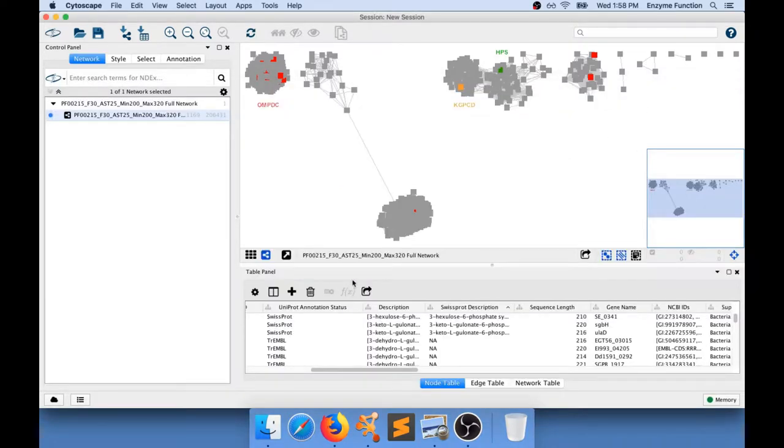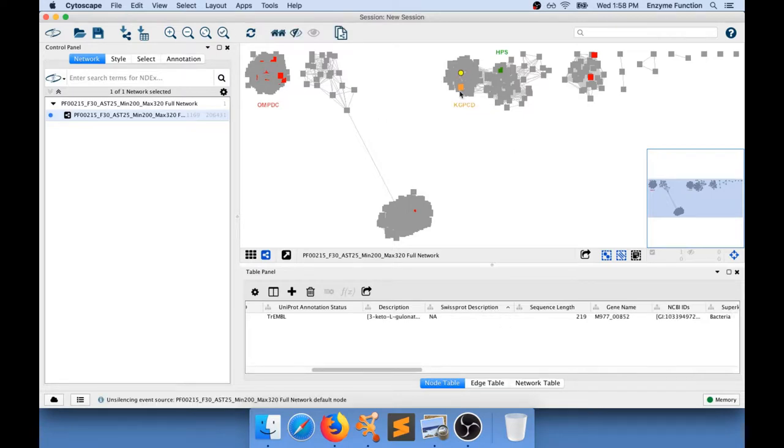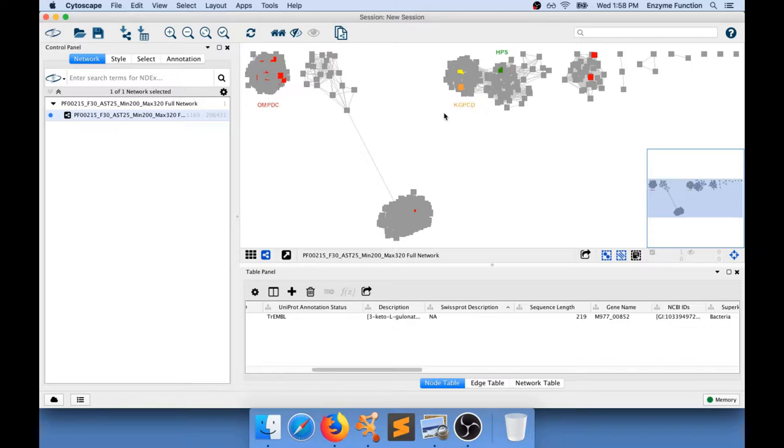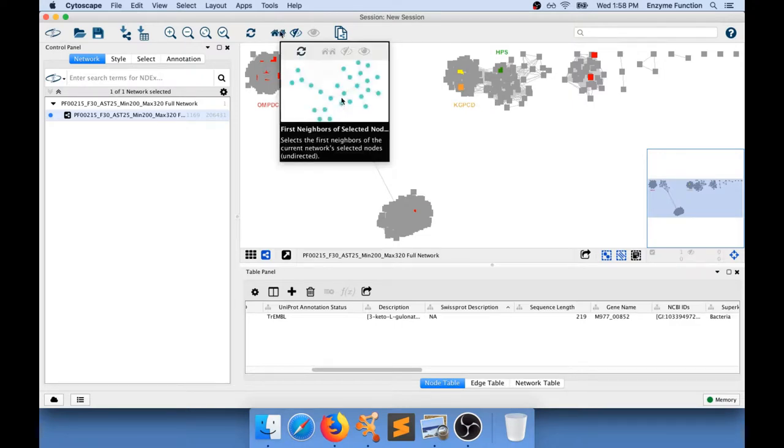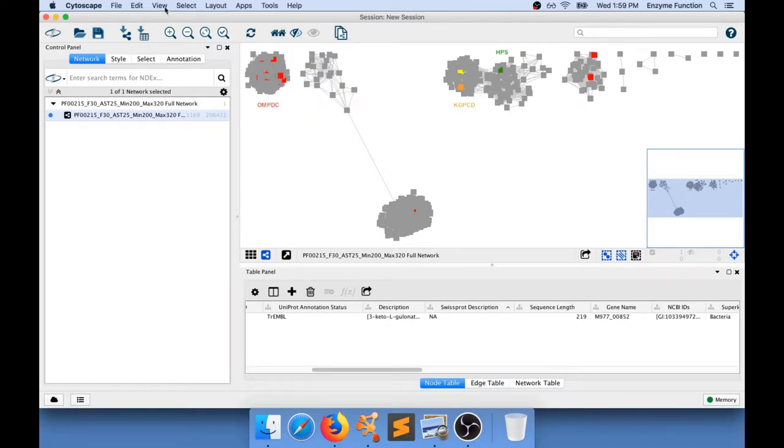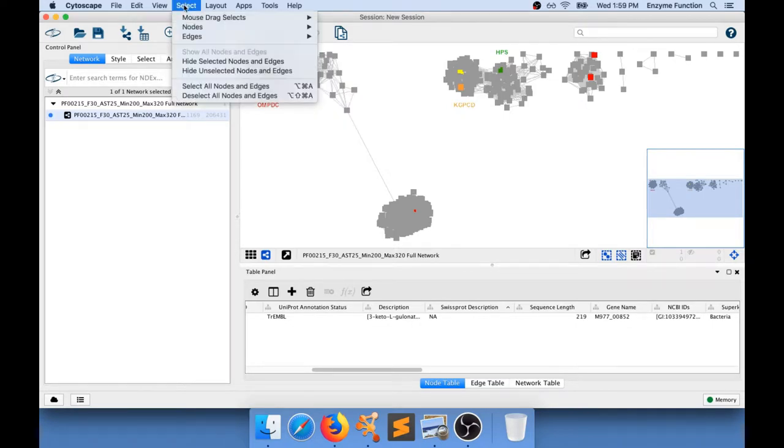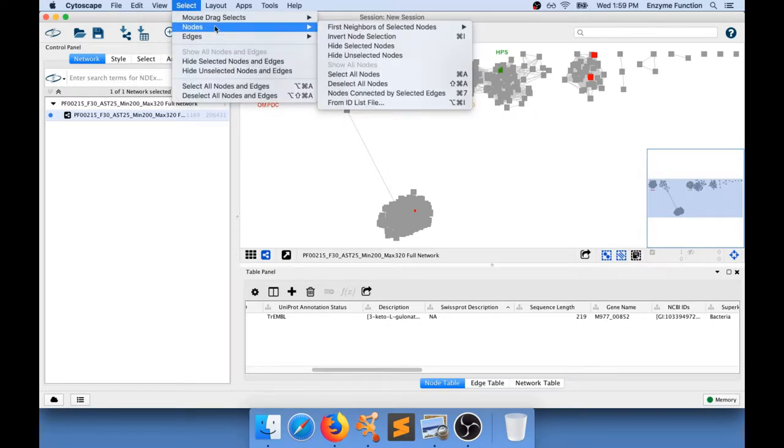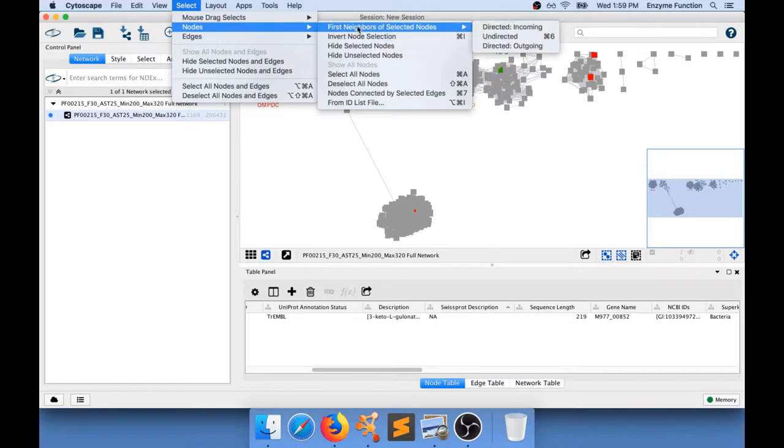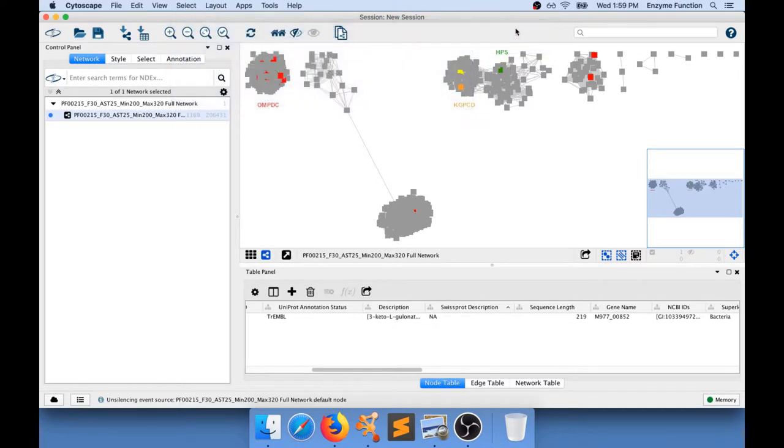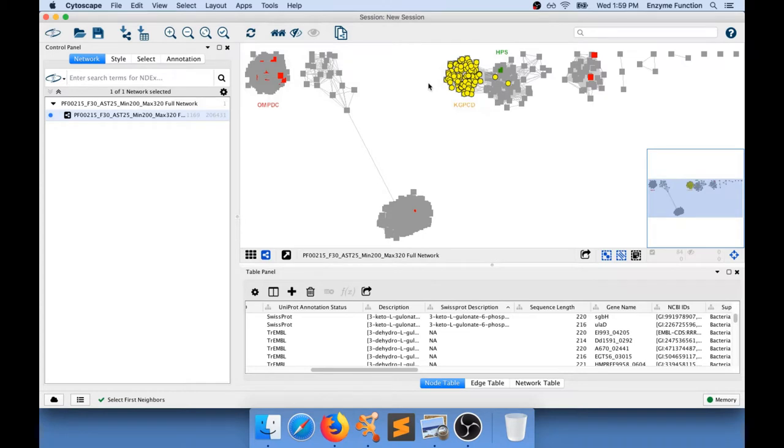So I have Cytoscape open in here and it's exactly the same network. If you click on any node in the network you're going to select it. Once you have a node that is selected you can actually use that particular button which says select first connected neighbors and you can also go and do select nodes first neighbors of selected nodes in an undirected way and you're going to select all the nodes that are connected to this one.